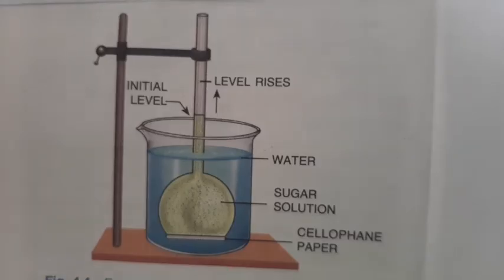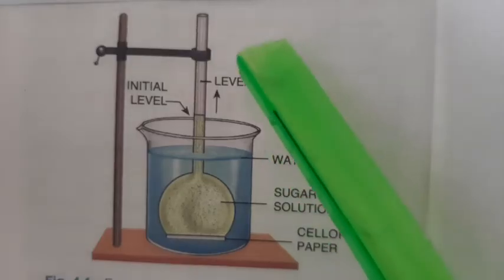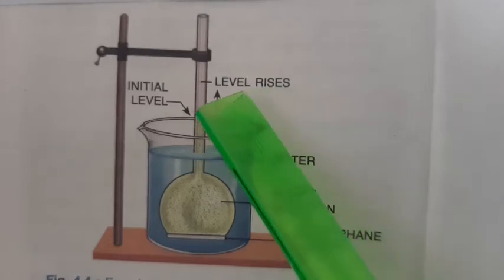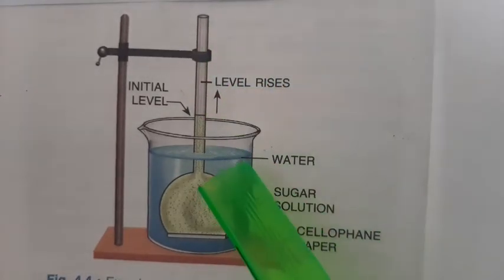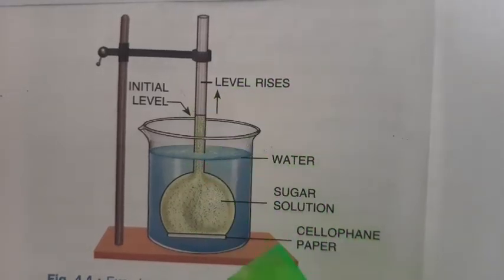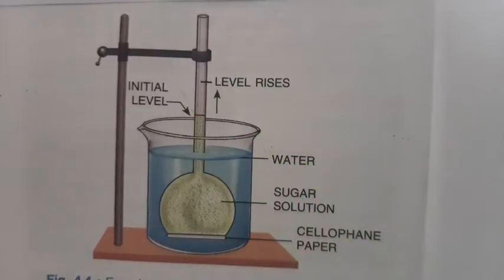The thistle funnel is fixed to the retort stand. Now it is very important to mark the level of the sugar solution in the stem of the thistle funnel. On the stem, you can see the first arrow showing the initial level, so the level of the sugar solution is marked.